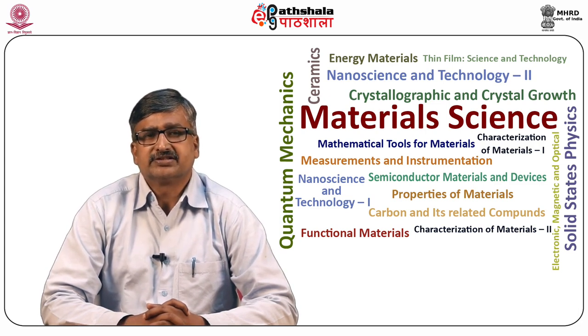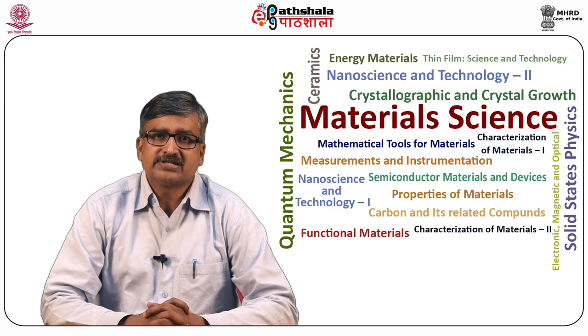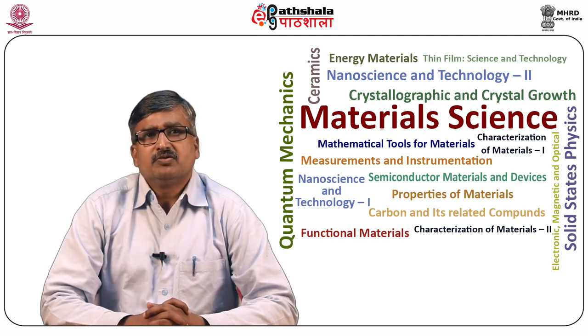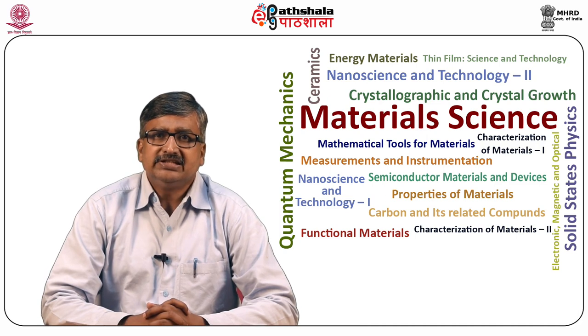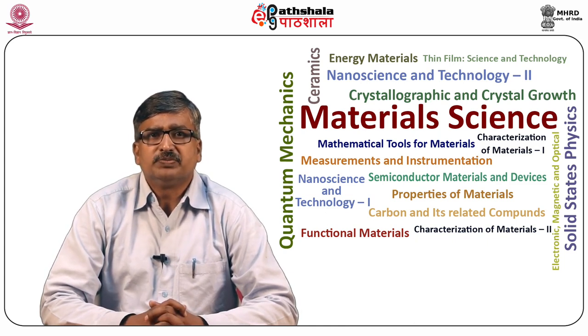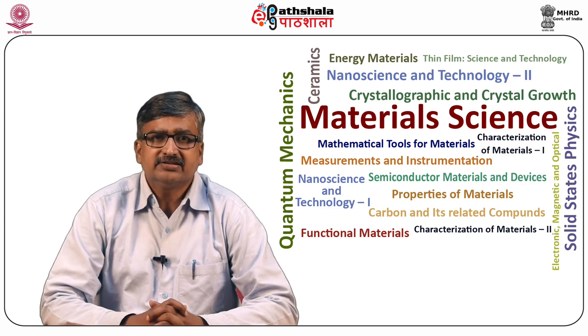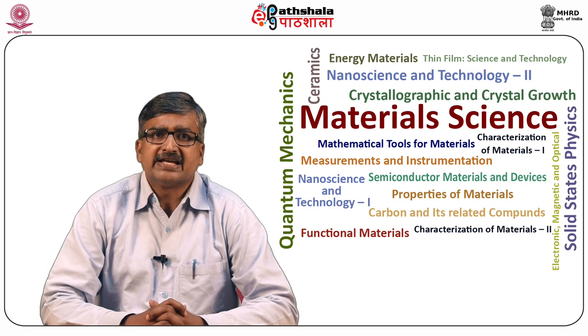The past 50 years has been a wonderfully exciting time for electron microscopists in material science, with continuous and rapid advancements. From the development of the theory of Bragg diffraction contrast and the column approximation, which enables us to understand TEM images of crystals and their defects, to the theory of high resolution microscopy, useful for atomic scale imaging, and on into the theory of all powerful analytical modes and associated detectors such as X-ray, cathodoluminescence, and energy loss spectroscopy.